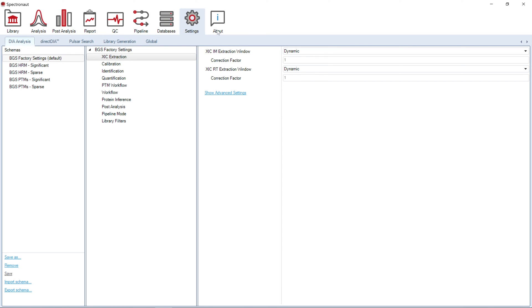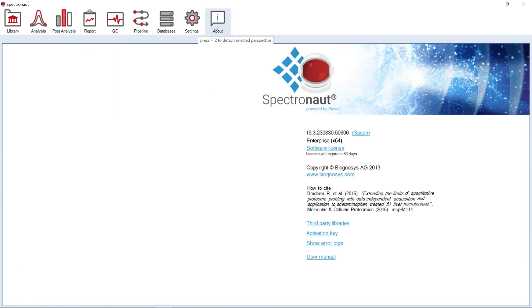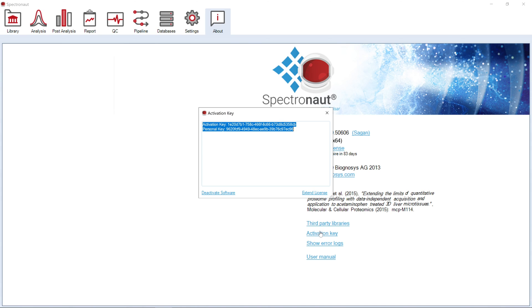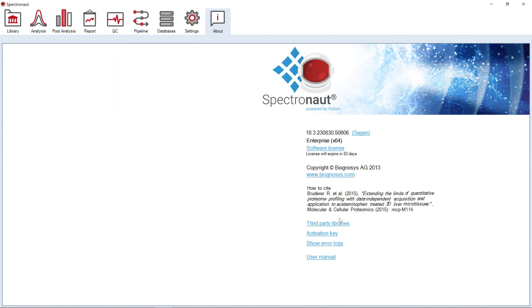Finally, in the About Perspective, you can find information on the software version you are currently using, your personal activation key, and last but not least, a software manual with a detailed description of software functionalities and features.